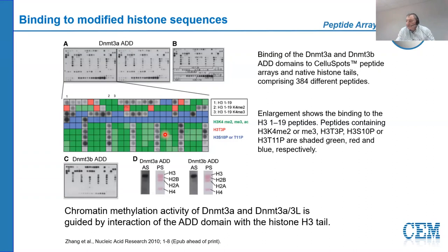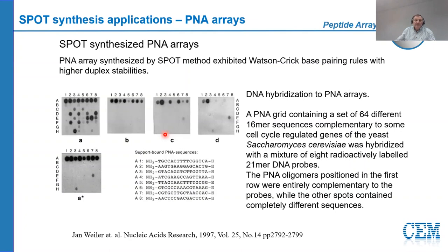Another interesting part has been the spot synthesis of PNA arrays. The PNA method on the spot exhibits the Watson-Crick base pairing rule with high duplex stability. And PNA spot synthesis is a very economical and handy procedure for screening of large numbers of DNA sequences.